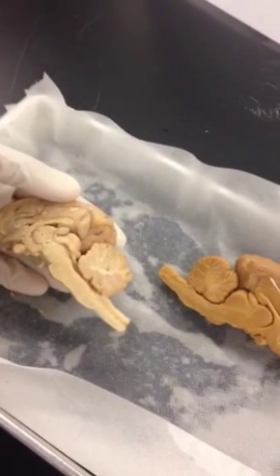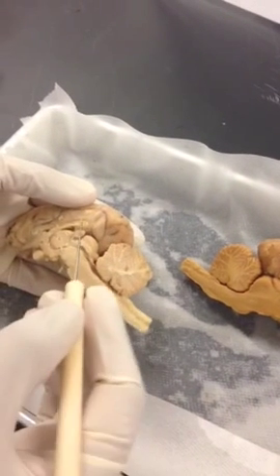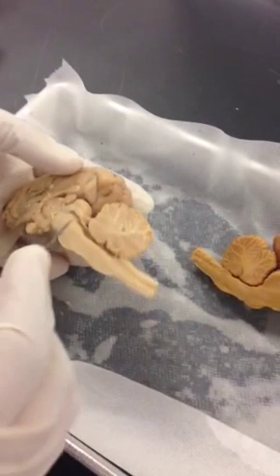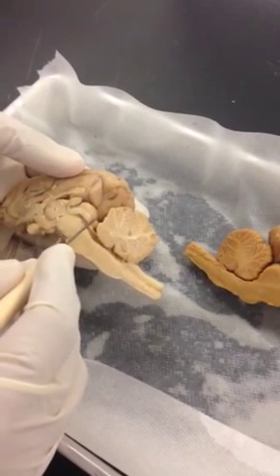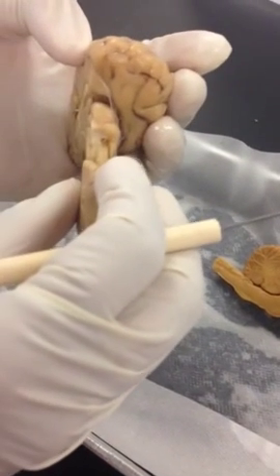So the best landmark is there are only two glands. One is inferior to the brain, which is your pituitary gland on the outside. The other gland is inside, deep inside. That's your pineal gland. Okay, and then you can see here the colliculi in this view, the superior and inferior colliculi we saw earlier, right?